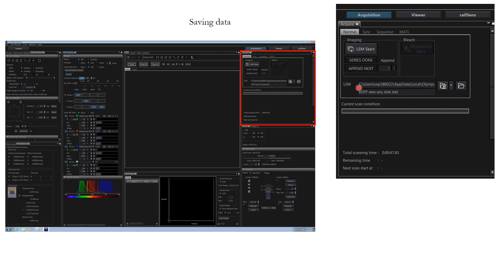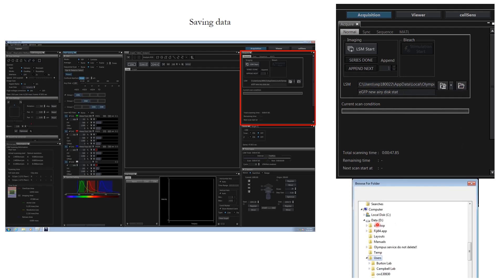So it's always a good idea to click on this option. It will open a dialog box like this where you can browse to a folder location of choice in the D drive if you are acquiring normal data. But if you are acquiring streaming data, meaning you are having a high volume of data and high speed data acquisition, then you can use the E drive which is a SSD solid state disk so it can acquire data at twice the speed compared to normal hard disk.